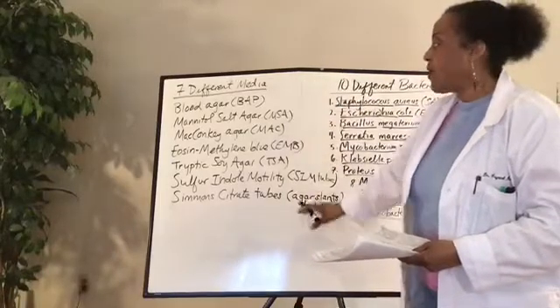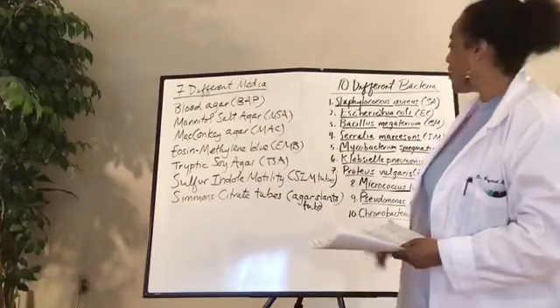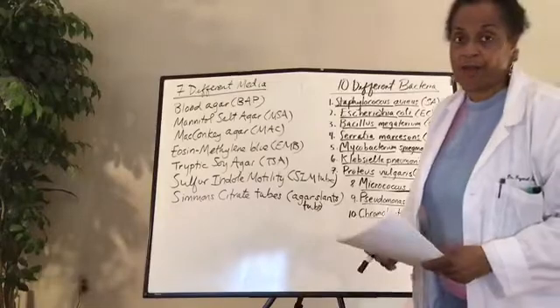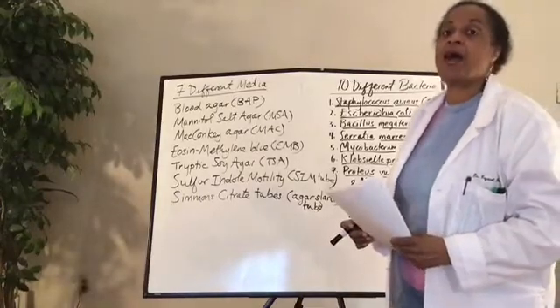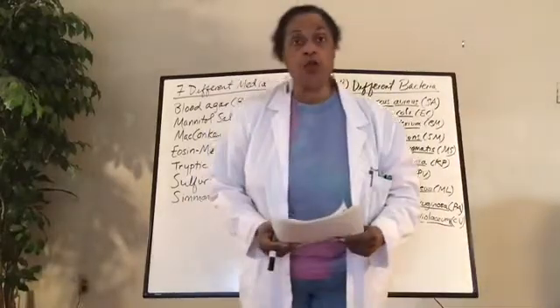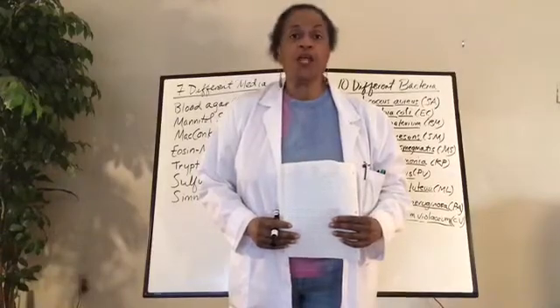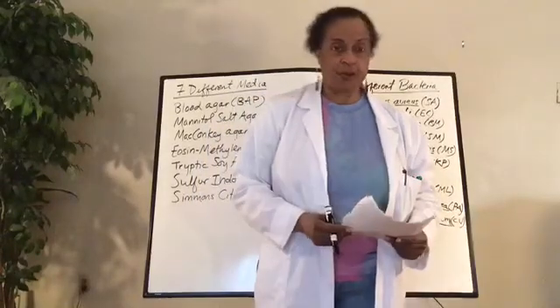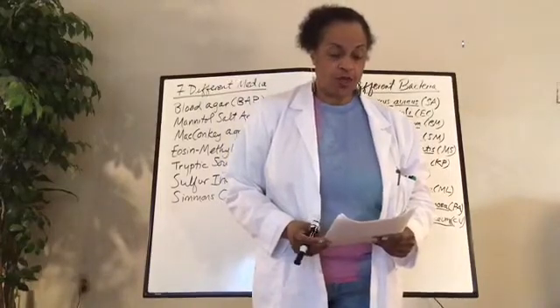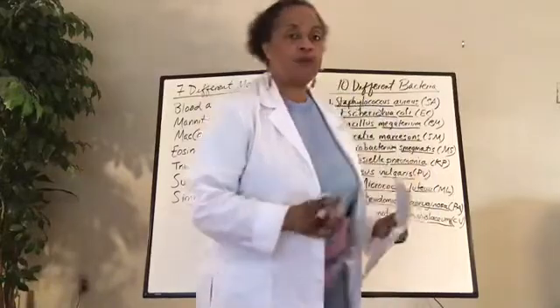So we've talked about all of the media. It's up to you to go over all these bacteria so you'll know which one is gram positive, which one is gram negative. I want that in your report as well, so I will know that you know what you're talking about. Because when you get ready to do your unknown, the first thing you're going to do is your gram stain. Okay, next we'll talk about broth cultures that you're going to use to inoculate all of your plates.